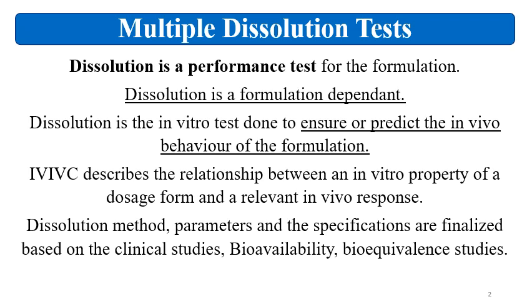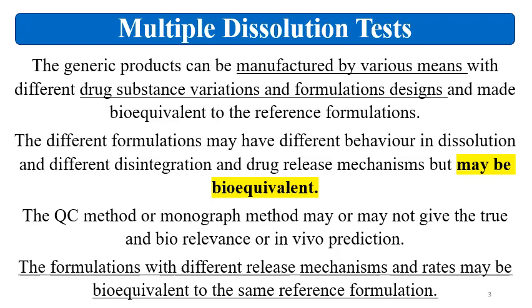So dissolution method, parameters and the specifications are finalized based on the clinical studies, bioavailability and the bioequivalence studies. Also, many of the time the shelf life studies are taken into consideration while giving the dissolution parameters and the specifications. Then the generic products can be manufactured by various means with different drug substances, variations in the formulation designs, and these products will be or may be bioequivalent to the reference formulations.